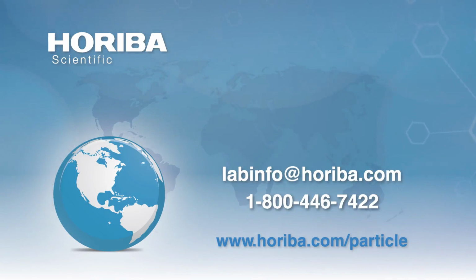And the other point is that when we talk about putting a particle in water and adding H plus or OH minus ions, protons and hydroxyl ions, in reality, what we're actually talking about is an exchange of electrons. It's an electron donor acceptor process, not a pH change. The pH is just because we're using water. But when you put a particle in a liquid, you get a difference in this electron donor acceptor equilibrium between the surface and the solution. And that dominates the ability to disperse materials.